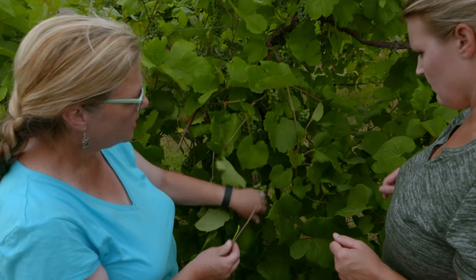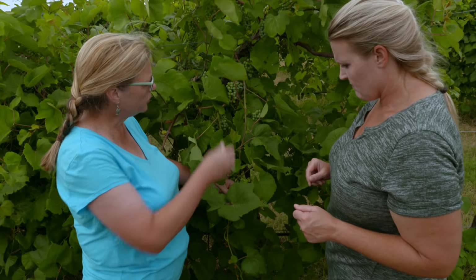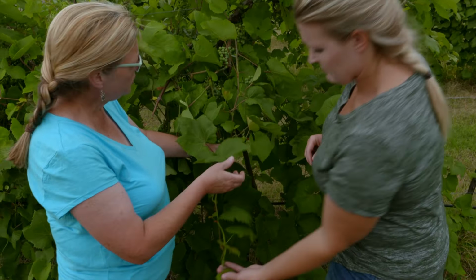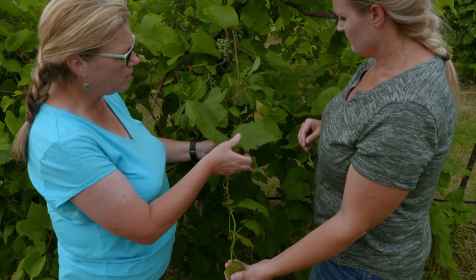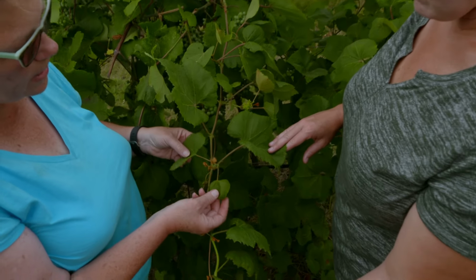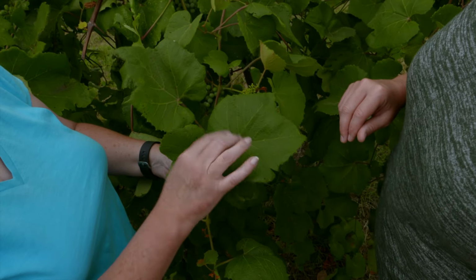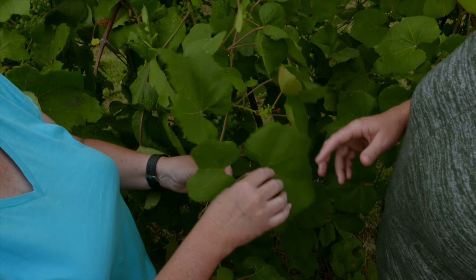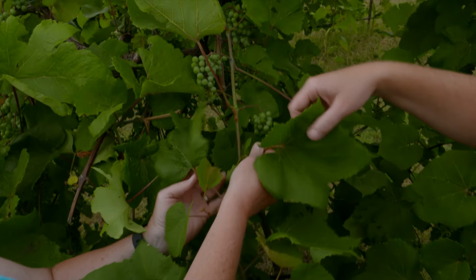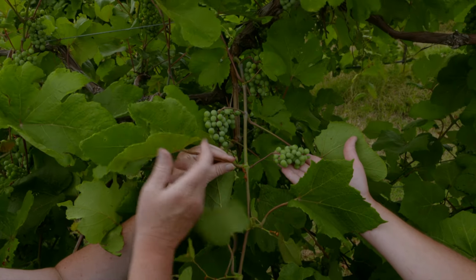No, we want to collect the petiole that's usually about the 6th or 7th mature leaf on the shoot up from the end. And it's usually just adjacent or opposite of a cluster. So if we look at this, these are actually kind of a flush of secondary growth from another bud. So we would count this as probably our first fully mature leaf right here. Okay. These are smaller. And then there's 1, 2, 3, 4, 5, and 6. So it's usually the 6th or 7th leaf, and we're just opposite of a cluster.